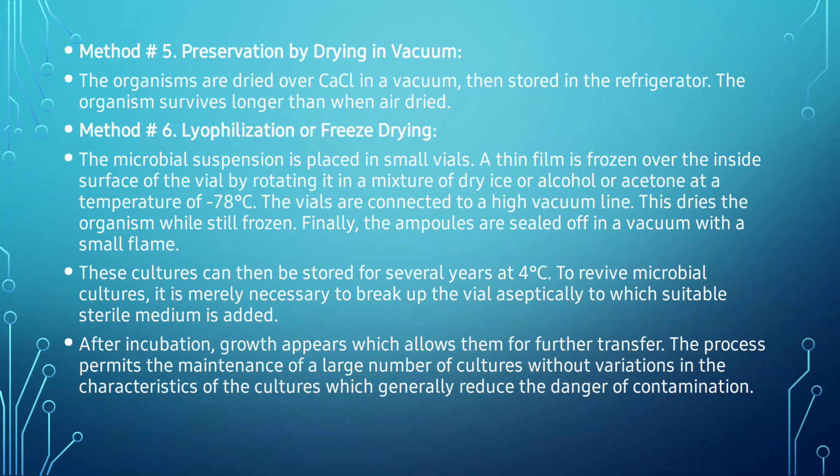To revive microbial cultures, it is merely necessary to break open the vial aseptically, to which a suitable sterile medium is added. After incubation, growth appears, which allows further transfer. The process permits the maintenance of a large number of cultures without variation in the characteristics of the cultures, and generally reduces the danger of contamination. These six methods are useful in preserving the culture.